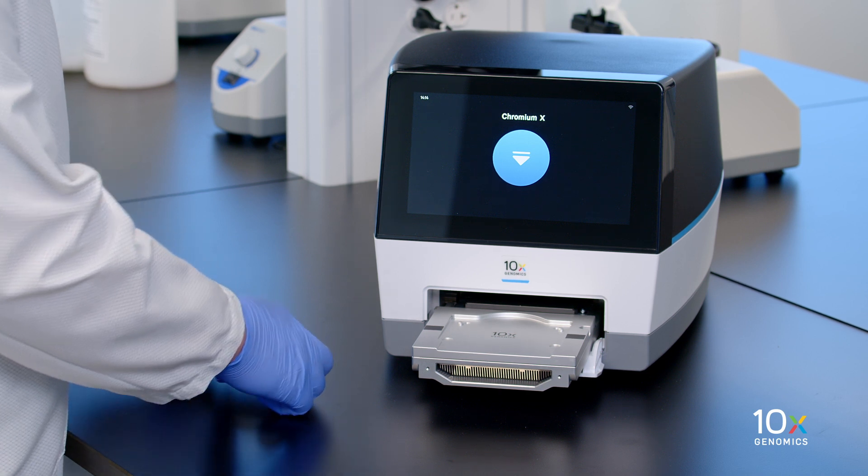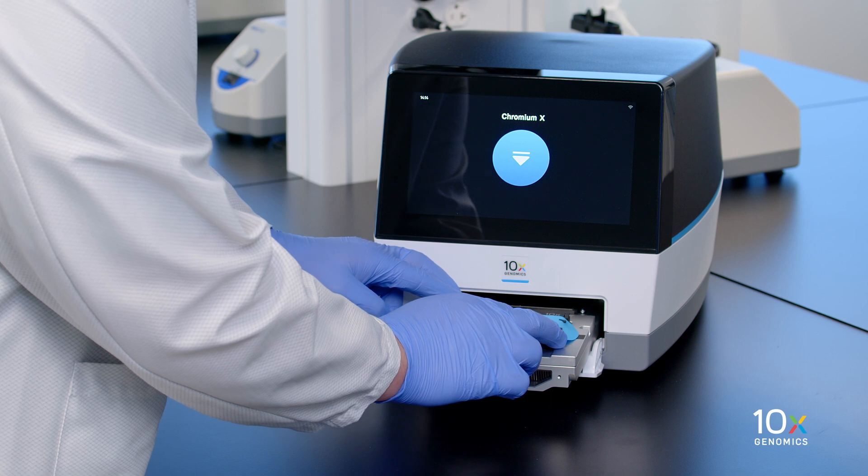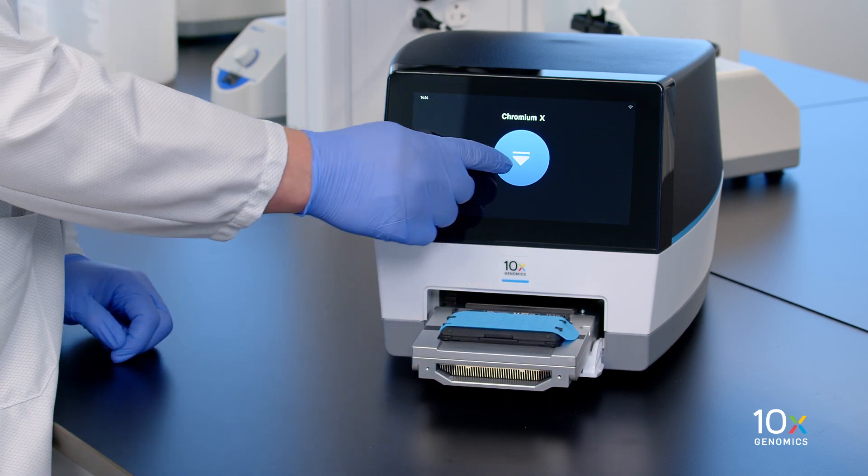Place the assembled chip with the gasket in the tray, ensuring that the chip stays horizontal. Press the button to retract the tray.